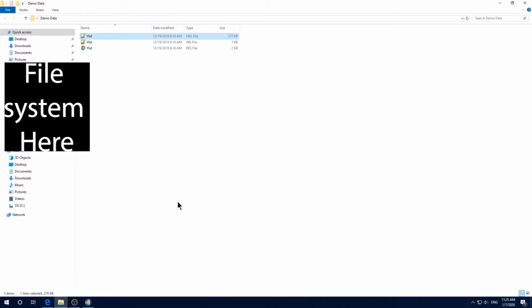Since I'm going to show you how to use Olex2 from the very beginning, I will delete the res file and start with the ins file here. In future, you can always start from the res file directly if you have one, and proceed directly to the refinement stage. Again, here I'm doing this solely because I want to show you how to solve the structure from scratch.